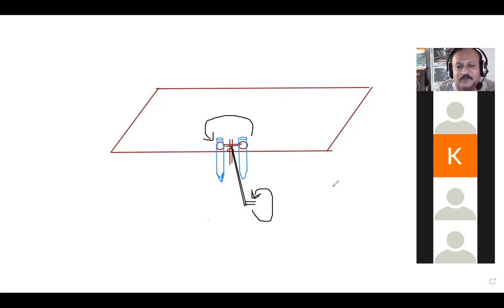So what you do normally is, you have prepared some precipitate, some complexes in the chemistry laboratory, inorganic complexes, if you remember. Precipitation reactions. After the complex is made, you take your suspension in the centrifuge tubes, put it on this hand-driven centrifuge machine, and then you just move this handle with your hands.